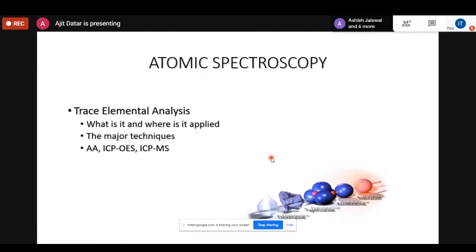Well, we have to first understand the available instruments as of today, and we'll try to look at this atomic spectroscopy to some extent. Again, I'm looking at the entire audience and trying to match everybody so that everybody would be able to take something out of whatever I'm presenting. Okay. So let us talk about these three techniques: ICP AES or OES, and ICP-MS.